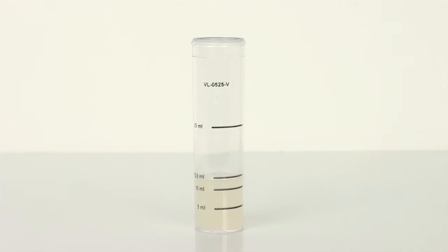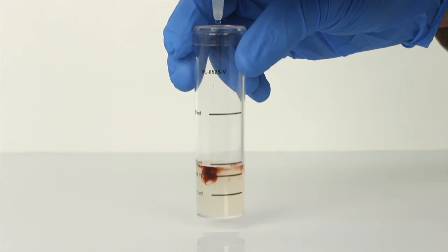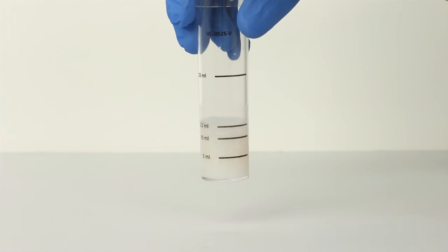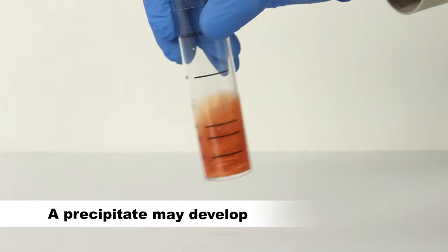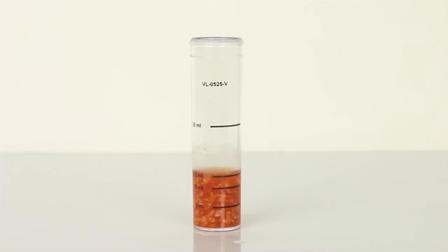The next step is to perform the titration using titrant reagent number 2. Add the titrant 1 drop at a time, swirling after each drop. Hold the bottle vertically for a consistent drop size, and remember to count the number of drops. The titration is complete when the sample color turns to brick red or orange red.